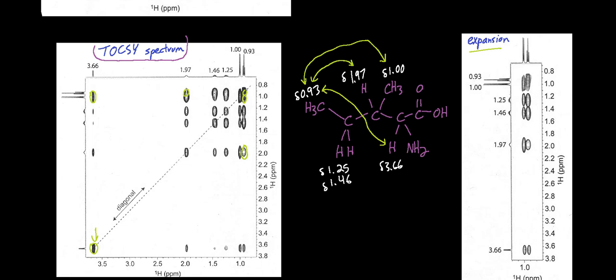Remember, we were hoping that if there was a second isoleucine, say here, that we would see another set of signals for it.